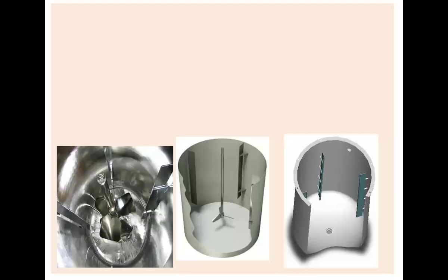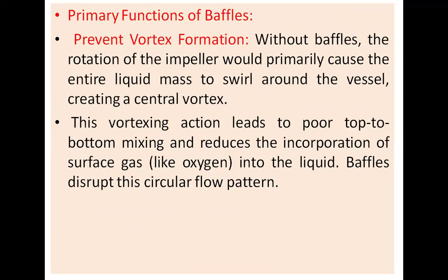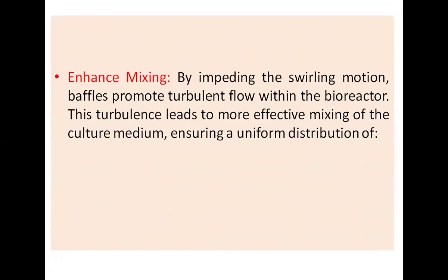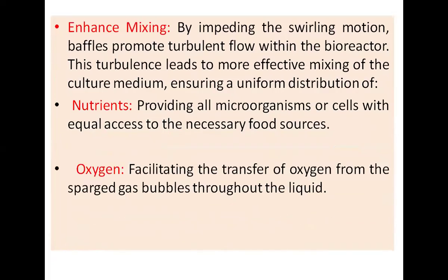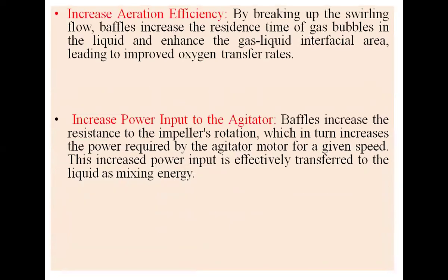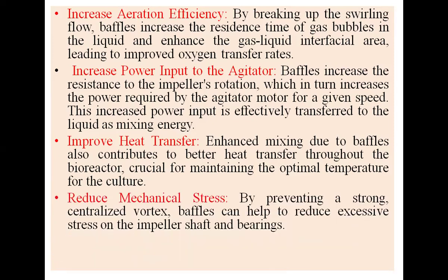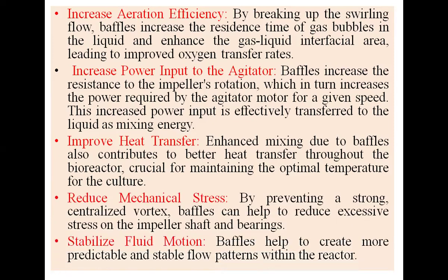From the beginning, we went through the baffles and the definition. Then we went through the primary functions of baffles: prevent vortex formation, enhance mixing of nutrients, oxygen, temperature, pH, increase aeration efficiency, increase power input to the agitator, improve heat transfer, reduce mechanical stress, and stabilize the fluid motion.